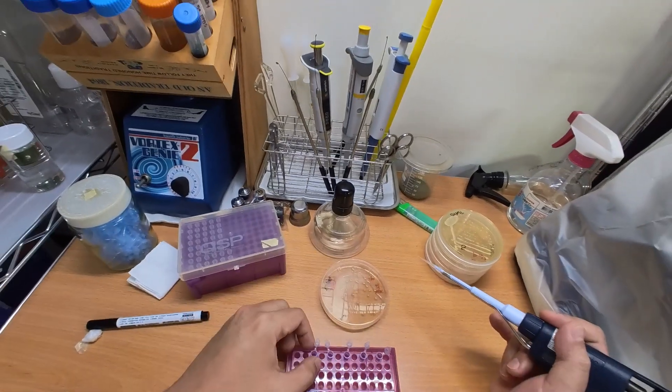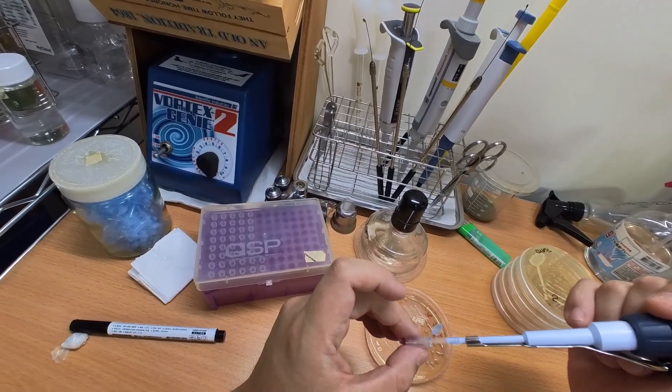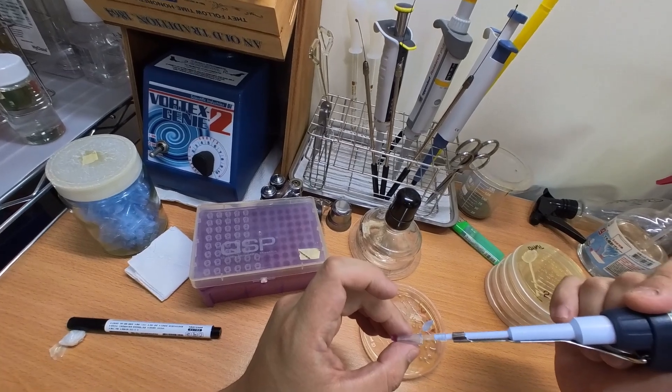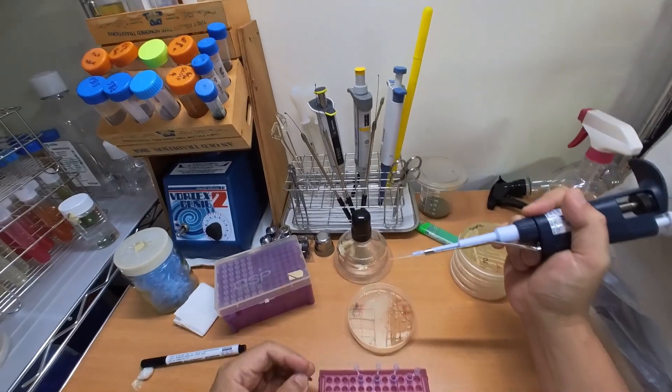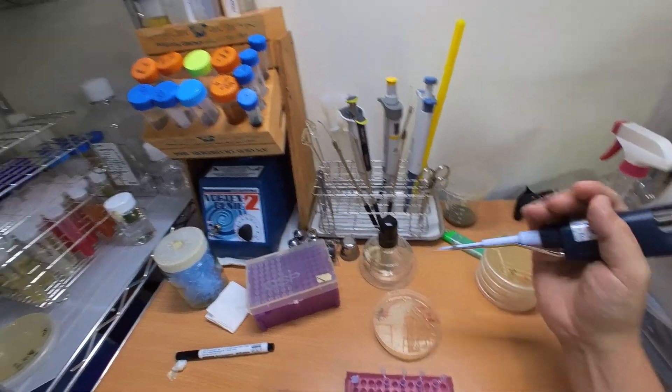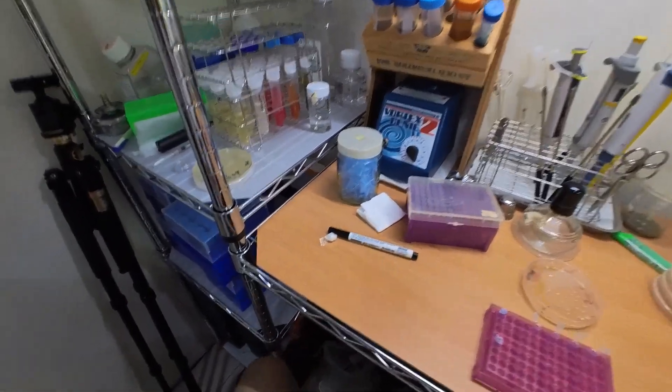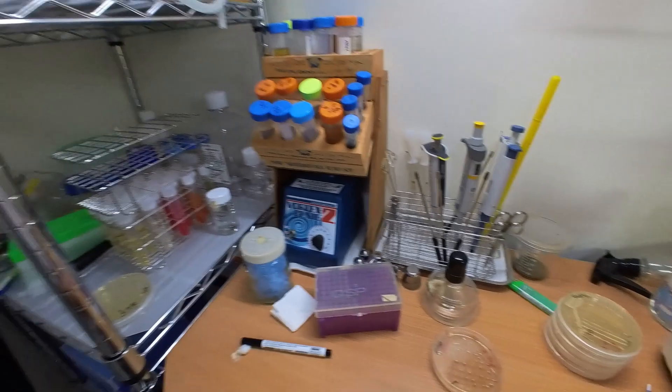The method is much easier and cheaper than traditional methods for individual hobbyists like me. Well, of course, there are other methods used in different labs around the world, but I think this one is better for the individual.